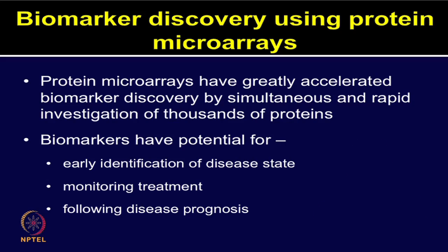various drug treatments. As you know, there is a need for early detection of disease and therapy for diseases such as cancer. However, the discovery of specific and sensitive markers remains challenging. Researchers have employed different types of technologies, including protein microarray based systems, to identify biomarkers which could be used for early disease detection as well as accurate detection, which could be employed in many applications.